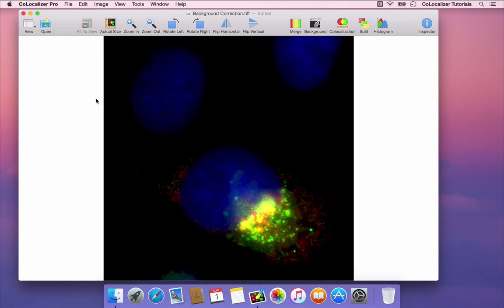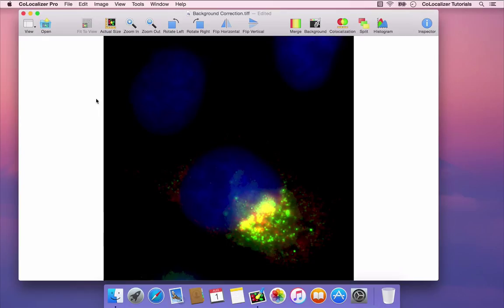When quantifying Colocalization, it is important to follow the changes of analyzed images during the background correction step. In Colocalizer Pro 3, you can see exactly what happens to them by comparing their histograms before and after correction.